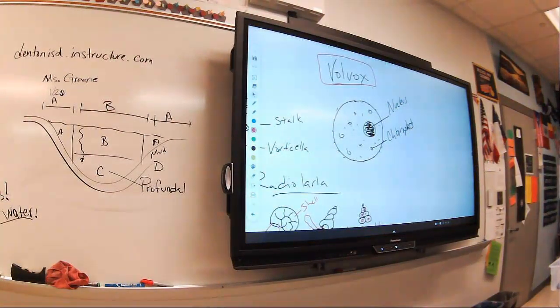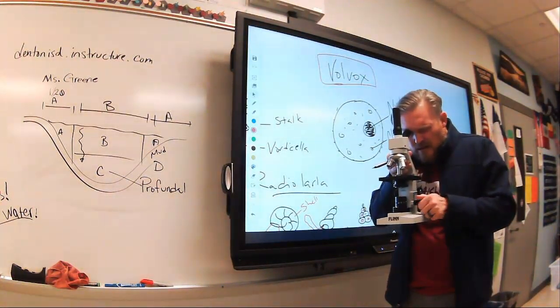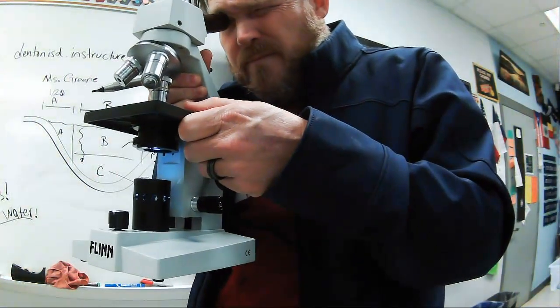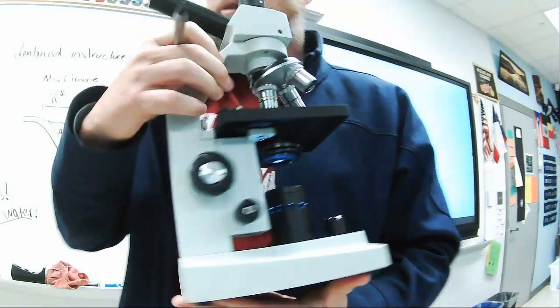Just out of curiosity, let me see if I can get that to show up on a microscope for you. Alright, so I'm going to hold this up to that and see if I can get it to work here.